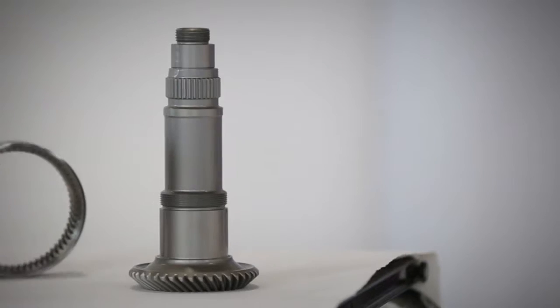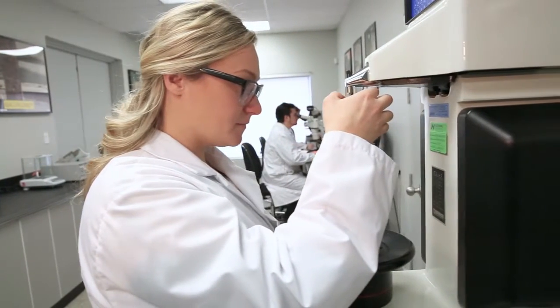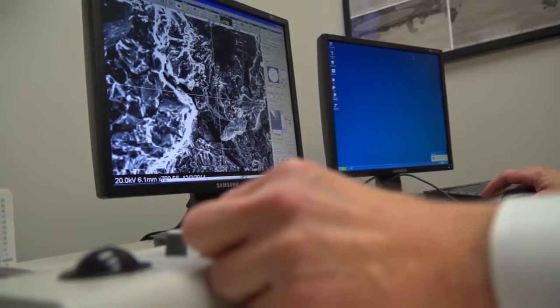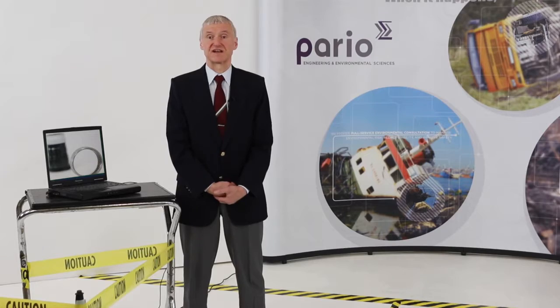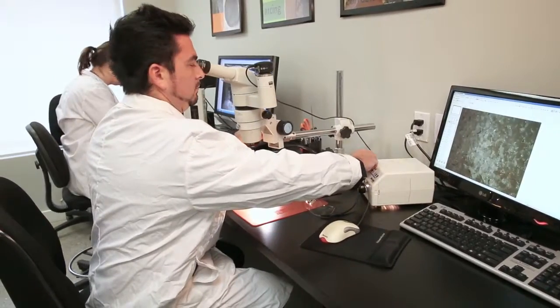The fracture surface holds all the information we need to determine the root cause of the failure. When we cut the sample to expose that fracture surface, it allows us to examine all the features of the fracture with high magnification, even up to 300,000 times if needed. Then further investigation with gathering in additional information creates all the pool of data which we later use to create our report.